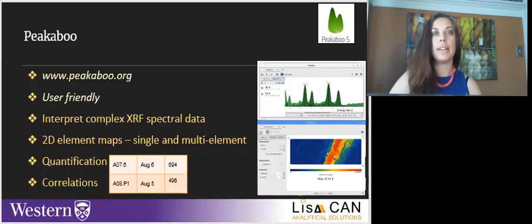From the data, users can identify and further interrogate correlations between elements, and most recently, using a multi-element reference material like a NIST standard, quantitative analysis can now be performed. Again, for more on these last two, please check out Stuart McIntyre's presentations.